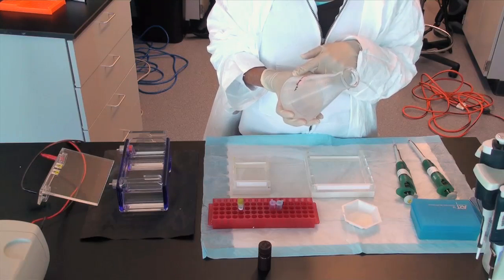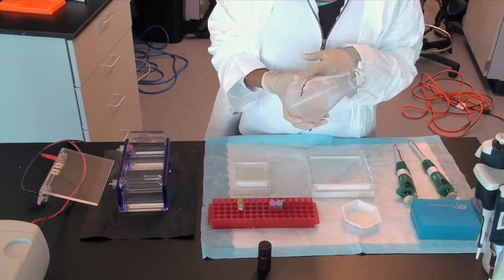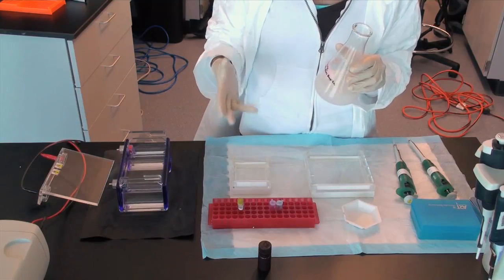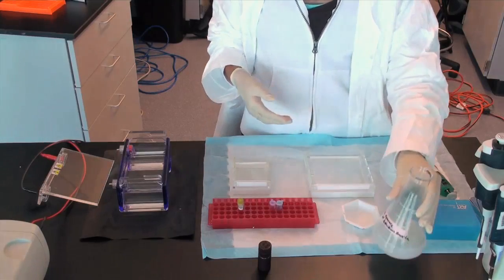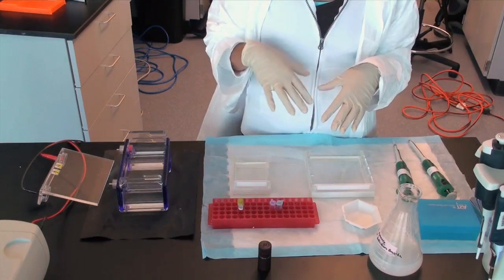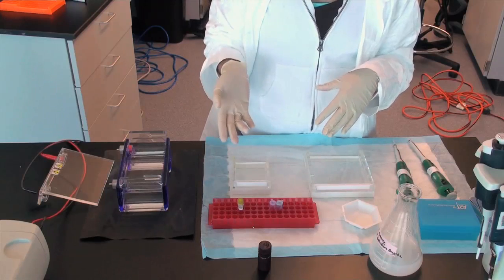The mixture is then heated to dissolve the agarose using a microwave. Swirling the mixture every minute or so helps to ensure a homogeneous solution and keep the liquid from boiling over. Heat until the agarose is completely dissolved into the buffer and the solution is clear.